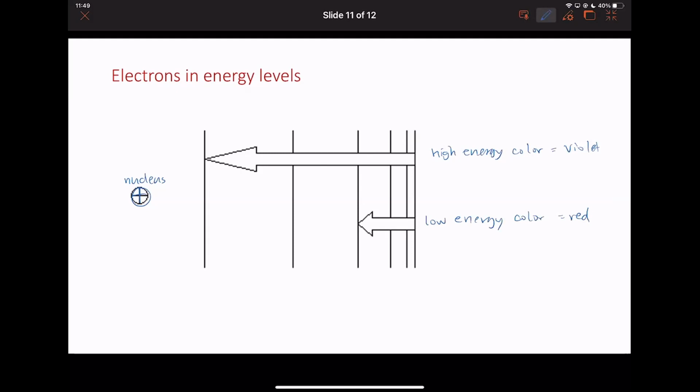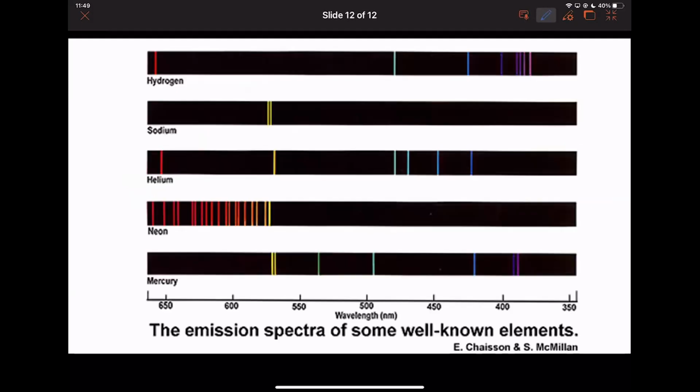Okay. It's these transitions that electrons can make inside of an atom that allow for those different colors that are seen as what are called the emission spectra. You have these for each of those flame tests. I could have taken each one of those colors and not just looked at the color, but also looked at it through a spectroscope and seen the lines, the component colors of that color.